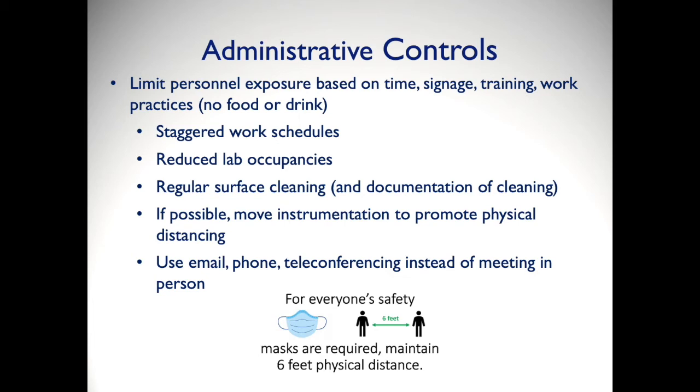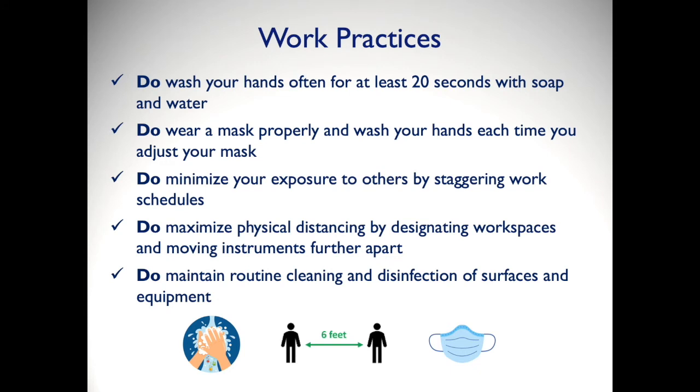If possible, move instrumentation to promote physical distancing, and use email, phone, and teleconferencing instead of meeting in person. What are some good work practices?